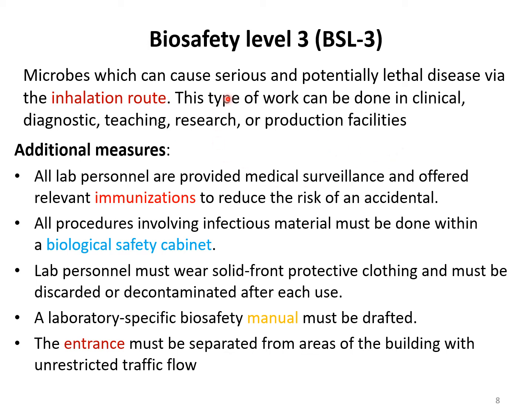So you can understand now that in BSL-3 the microorganisms are more dangerous, and the requirements are more sophisticated. We need extra precautions. The additional measures include the BSL-1 and BSL-2 requirements plus additional measures.